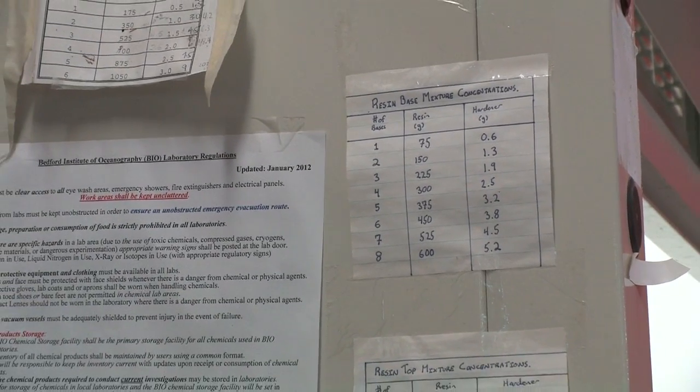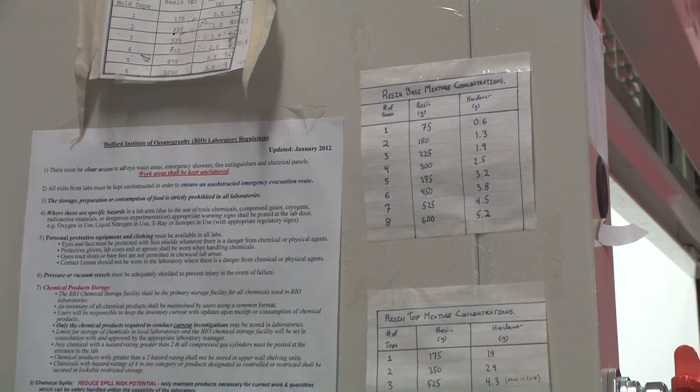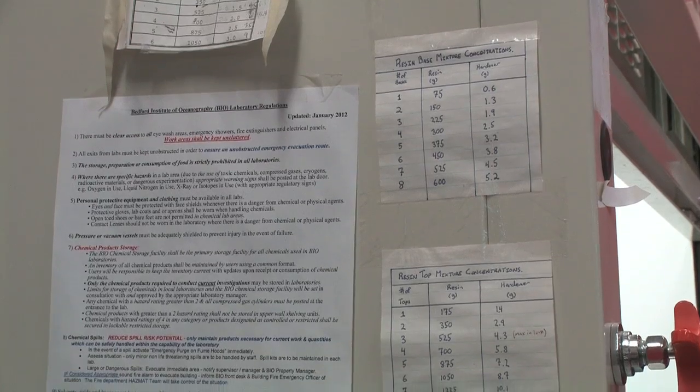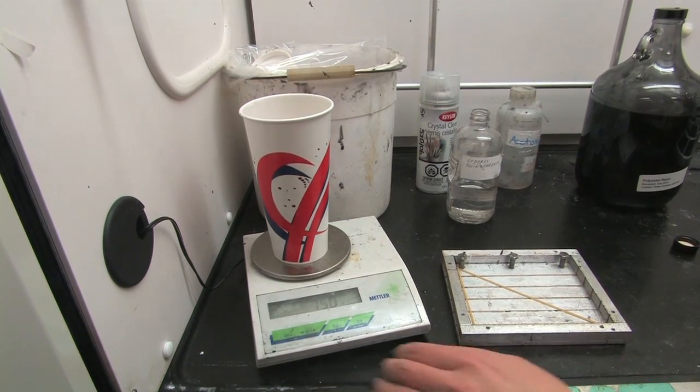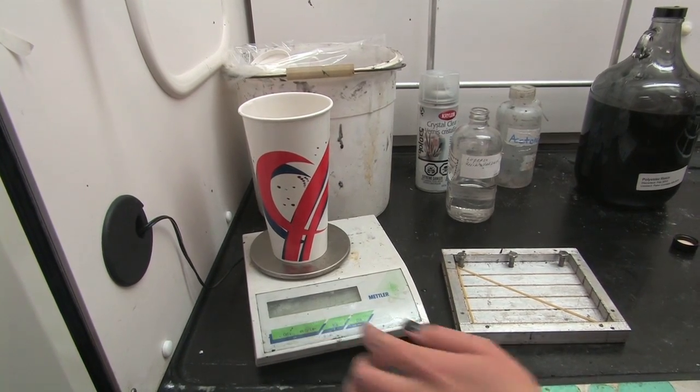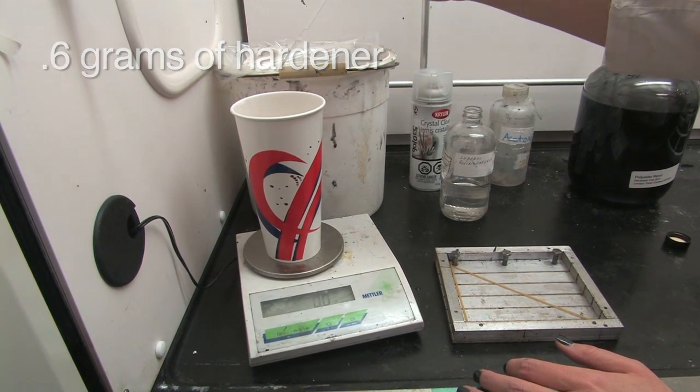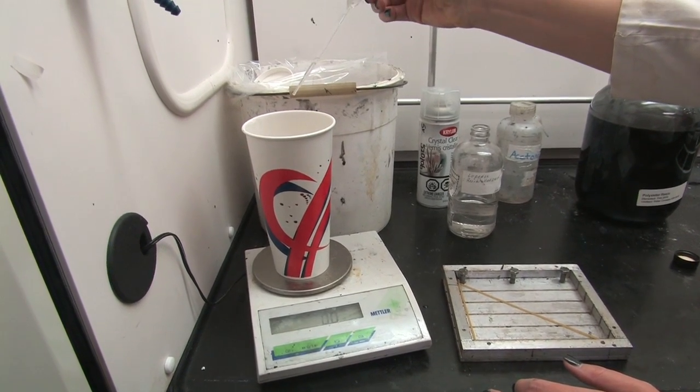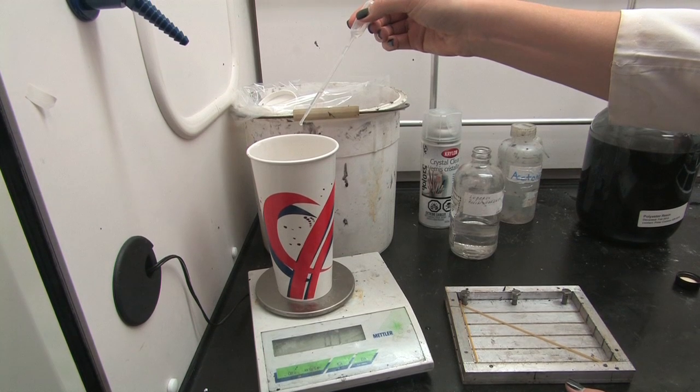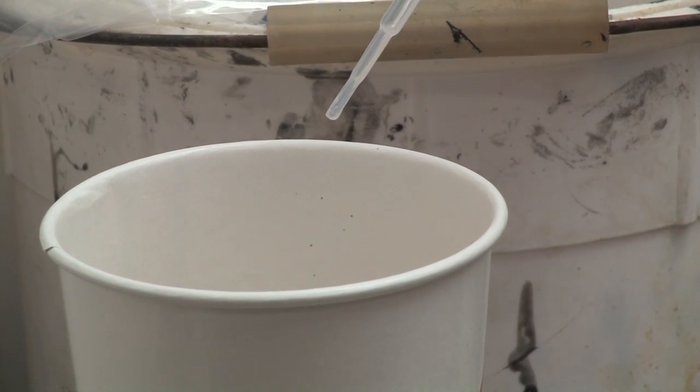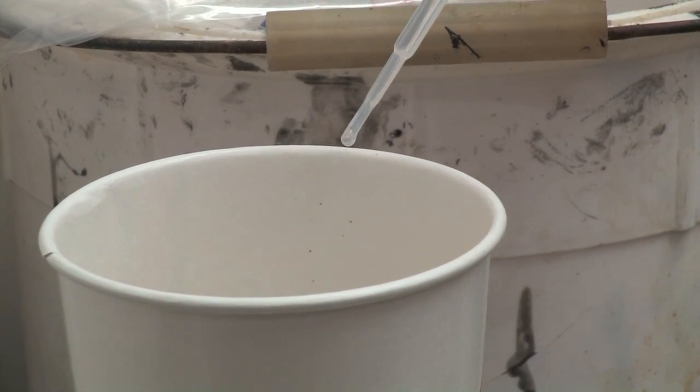In this lab we keep lists of resin to hardener concentrations on the side of the fume hood. Next, we add hardener. So we tare the scale again and based on our chart, we add 0.6 grams of hardener. This measurement has to be fairly exact because the epoxy and hardener together have an exothermic reaction and if mixed incorrectly could cause a fire.